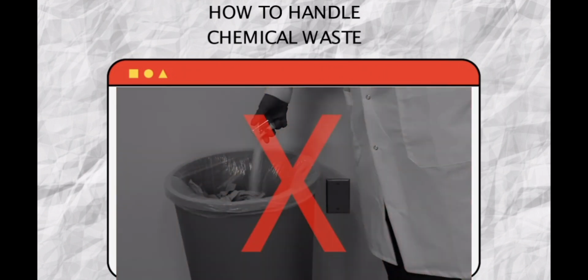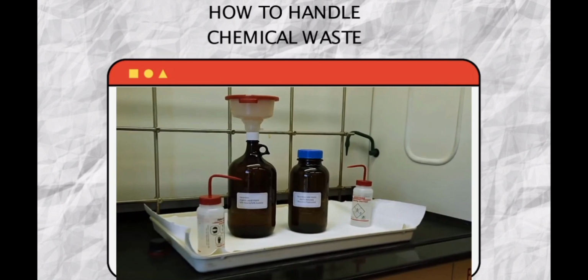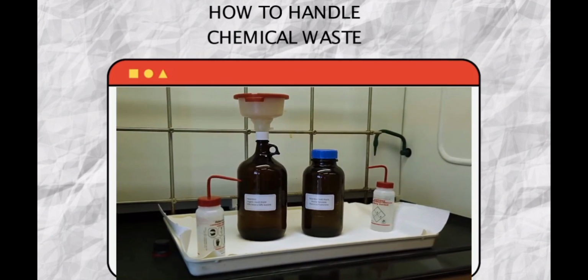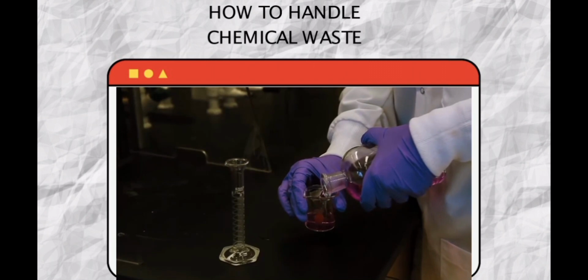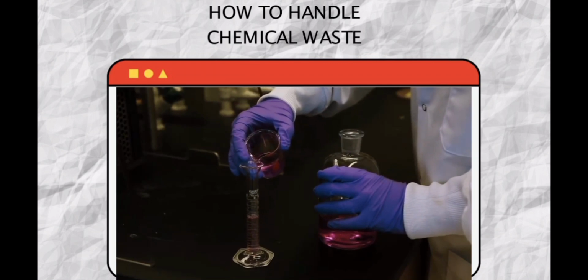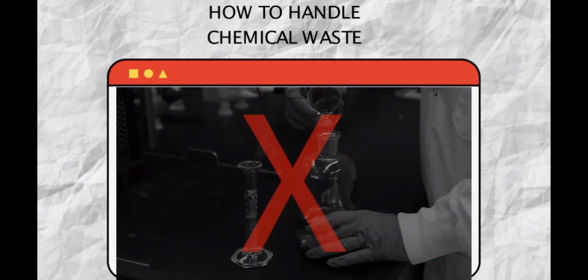Absolutely no waste should be thrown away in the trash. All liquids, including both reaction products and leftover chemical reagents, should be placed in the appropriately labeled bottle in the fume hood designated for waste collection. If you obtain too much of a chemical and have excess left over at the end of the experiment, do not return the reagent to the bottle you obtained it from. This excess reagent is contaminated and should be placed in the waste bottle.